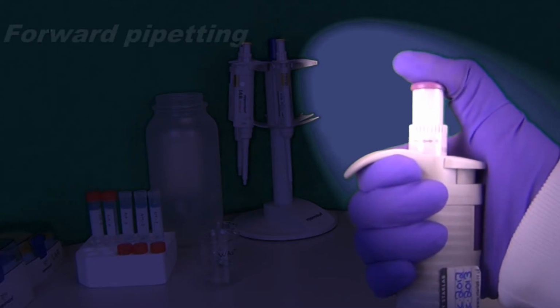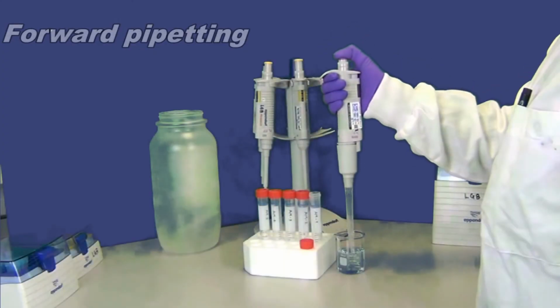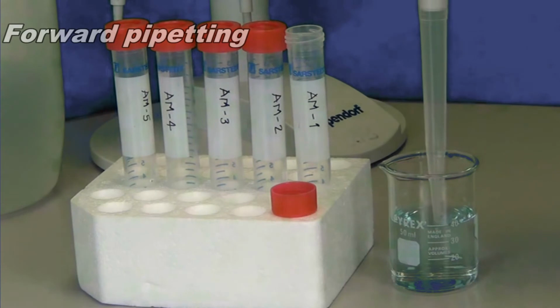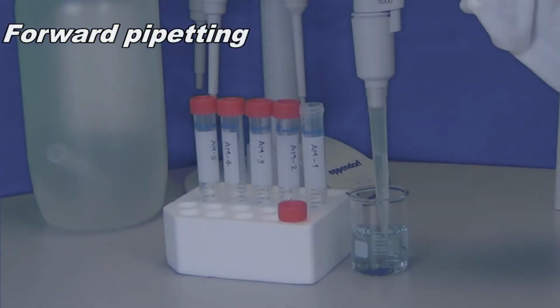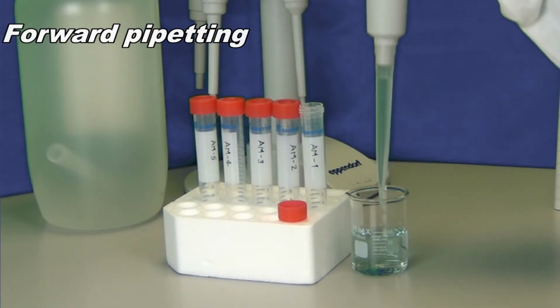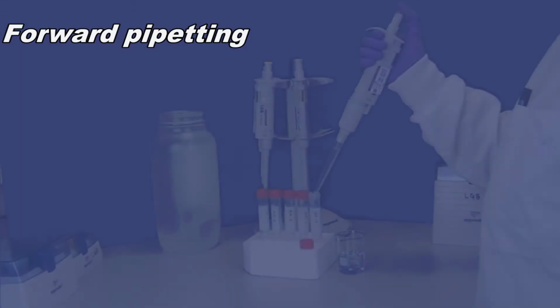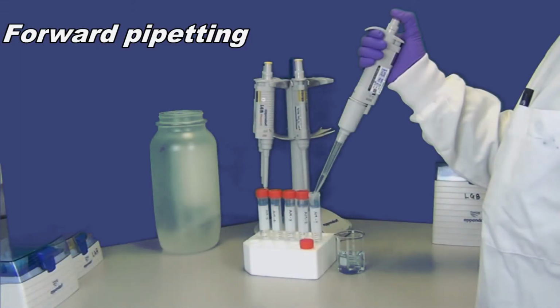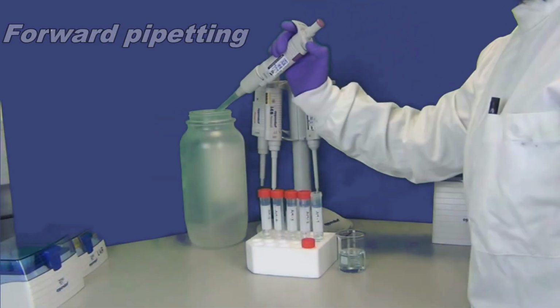Press the operating button down to the first stop. Immerse the tip a few millimeters into the liquid. Release the operating button slowly. The tip will fill up. Dispense the liquid by pressing the operating button down to the first stop. Then blow out the remaining liquid by pressing the operating button down to the second stop. Replace the tip to avoid sample contamination.